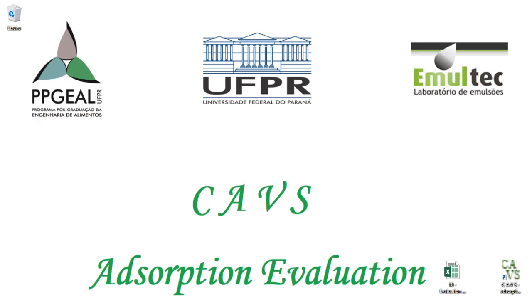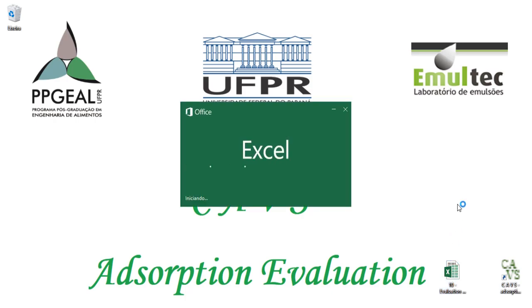Hello everyone, in this tutorial I will show you how to use the menu data without replications for equilibrium data. This module was developed to verify if the experimental data reached a constant behavior based on the gradient method. Initially, it is necessary to prepare the sheet with the data.